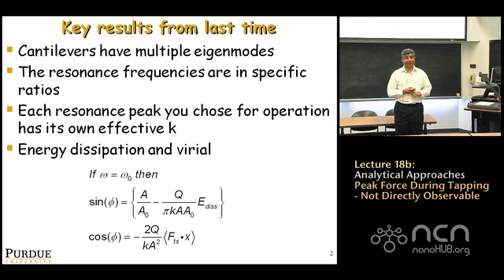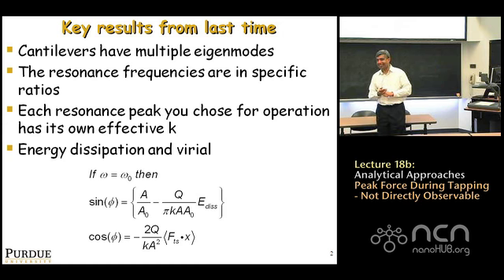Has anyone of you had a chance to look at your AFM system to see if it plots phase lag or phase lead? Yeah? And? So you did, yes, of course. And it's phase lag, right? Okay. Not easy to figure out. I mean, you have to do this tuning curve and really sort it out pretty well. It's not easy. It's tricky. And if you don't do it, you don't know what you're seeing. You don't know what dark and bright spots mean in an image, right? Something so important.